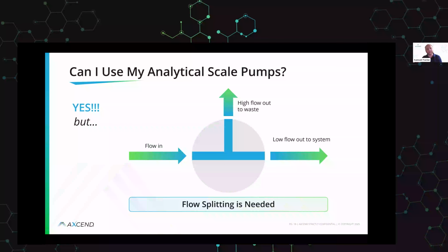That way, when you apply that same 1 milliliter a minute to the system, the column experiences its 1,000 PSI and whatever flow rate is required for that, and the high flow takes the remainder of that solvent. So you're able to get steady baselines, rapid gradients. However, you are still using analytical scale volumes. You just are able to still perform those capillary scale separations.